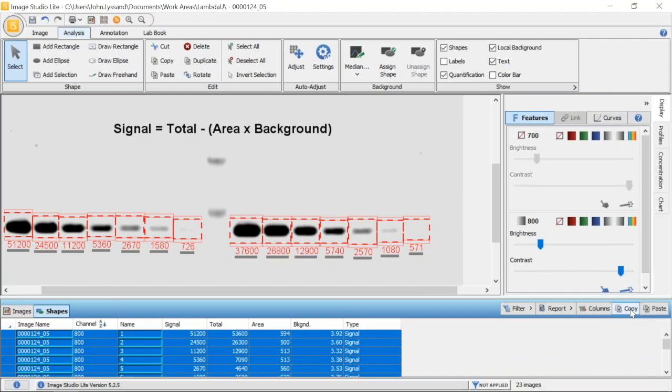Those are the basics of how to accurately and precisely quantify a Western blot image using Image Studio Lite software. If you want to learn more about Image Studio Lite and how to use it, you can find a number of support videos and resources at www.licor.com slash islite. Thanks for taking the time to watch these lessons and good luck with your own analysis.